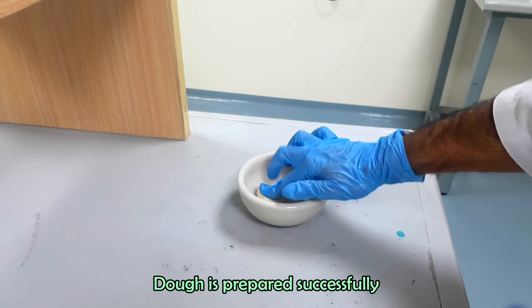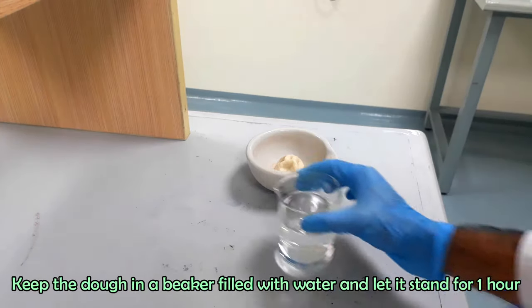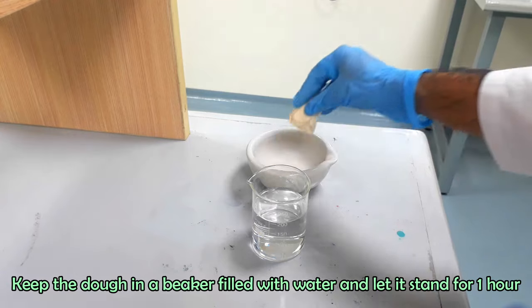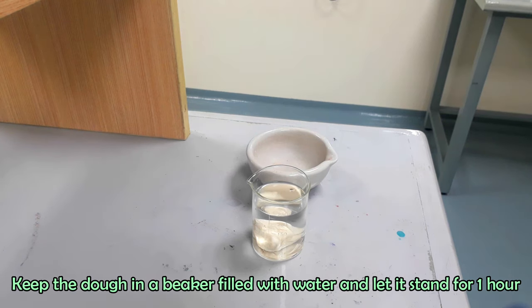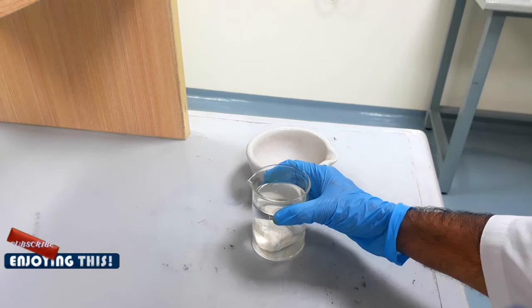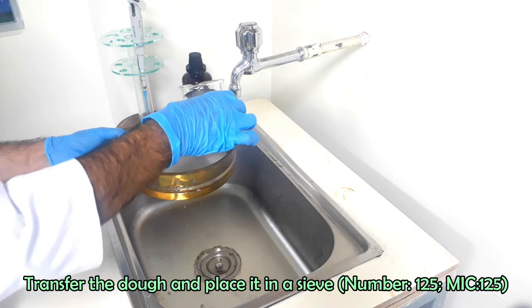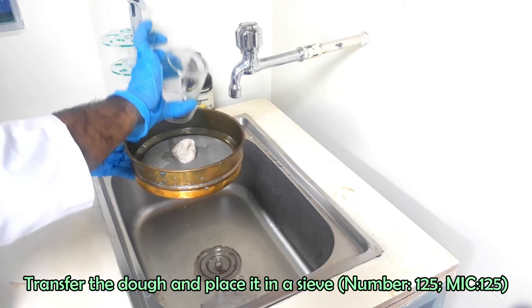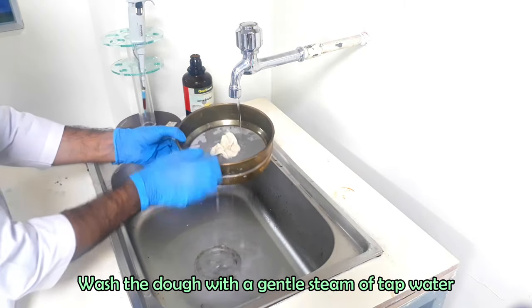Dough is prepared successfully. Now we will extract gluten from the dough. Keep the dough in a beaker filled with water and let it stand for an hour. After 1 hour, remove the dough and place it in a sieve of 125 number. Wash the dough with a gentle stream of tap water.